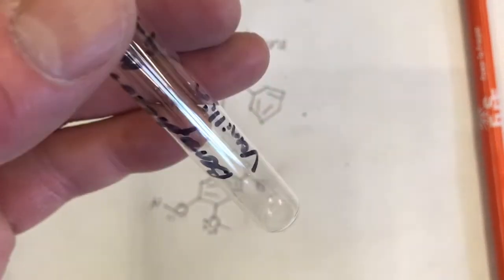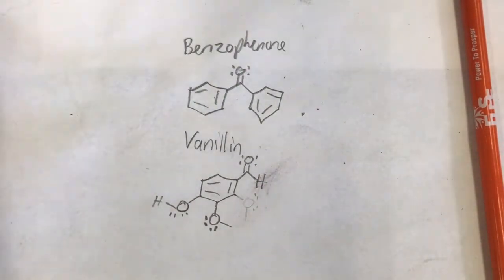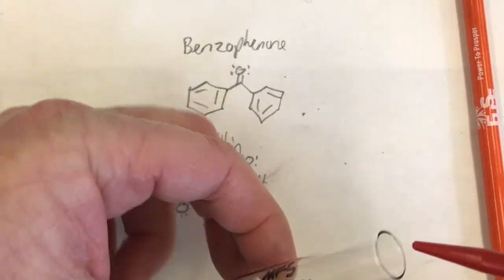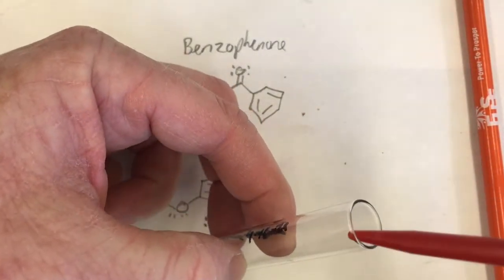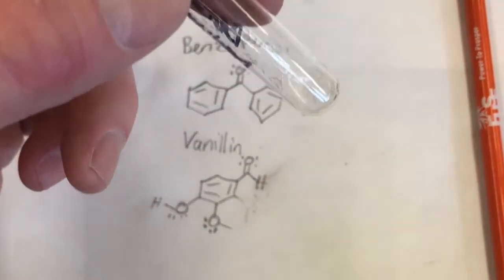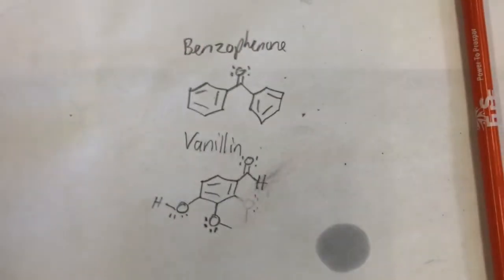There we go. And I could dissolve it in acetone, that works, or methylene chloride, or any organic solvent that will dissolve the two, and then when I spot on the TLC plate it will evaporate quickly. Anything like that will be fine, because it's just a solvent to transfer the sample to the TLC plate. So I'm going to use acetone. I've got acetone right here. Squirt some in there, and a little more squirt. That looks good. Looks dissolved to me. I'm ready to go with that.